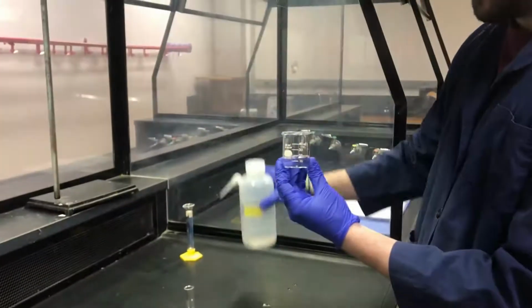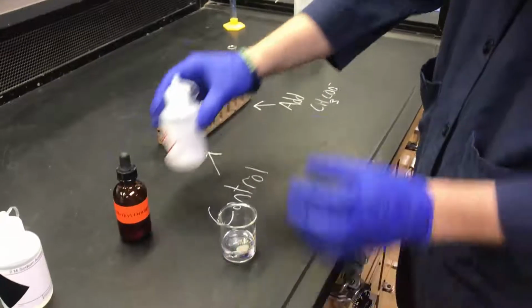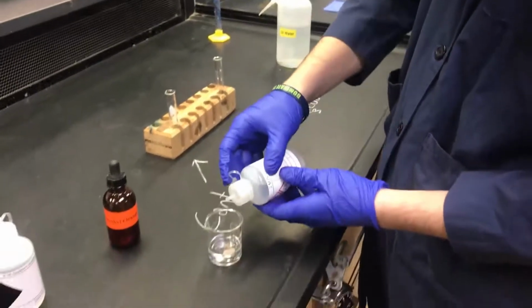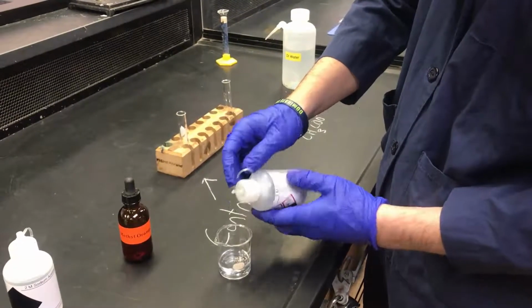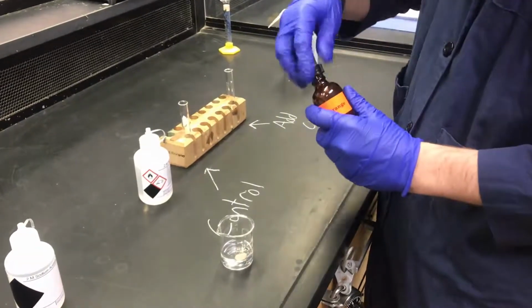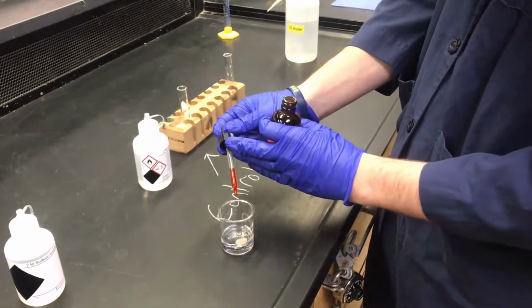So here in part 3, we have added 15 mL of DI water to our 50 mL beaker. And we're going to add a few drops of 2 molar acetic acid, and then a few drops of our methyl orange indicator also into the beaker.